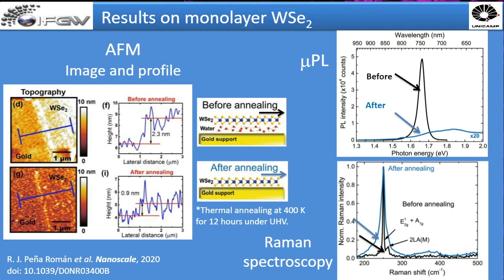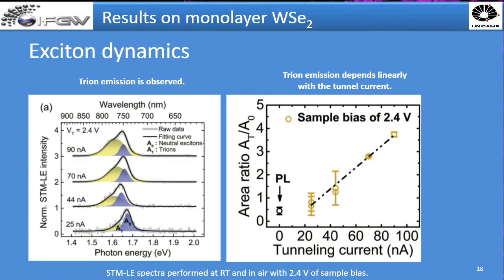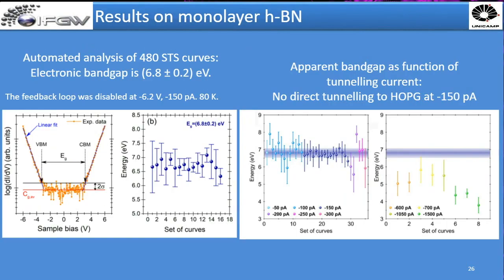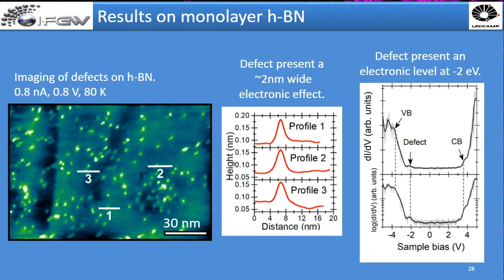Here's another question. You show cathodoluminescence on the hexagonal boron nitride up to 300 nanometers and not to shorter wavelengths. Why is there no band-to-band emission? So that's a very good question. I'll just put the slide up so that everyone has it in mind.